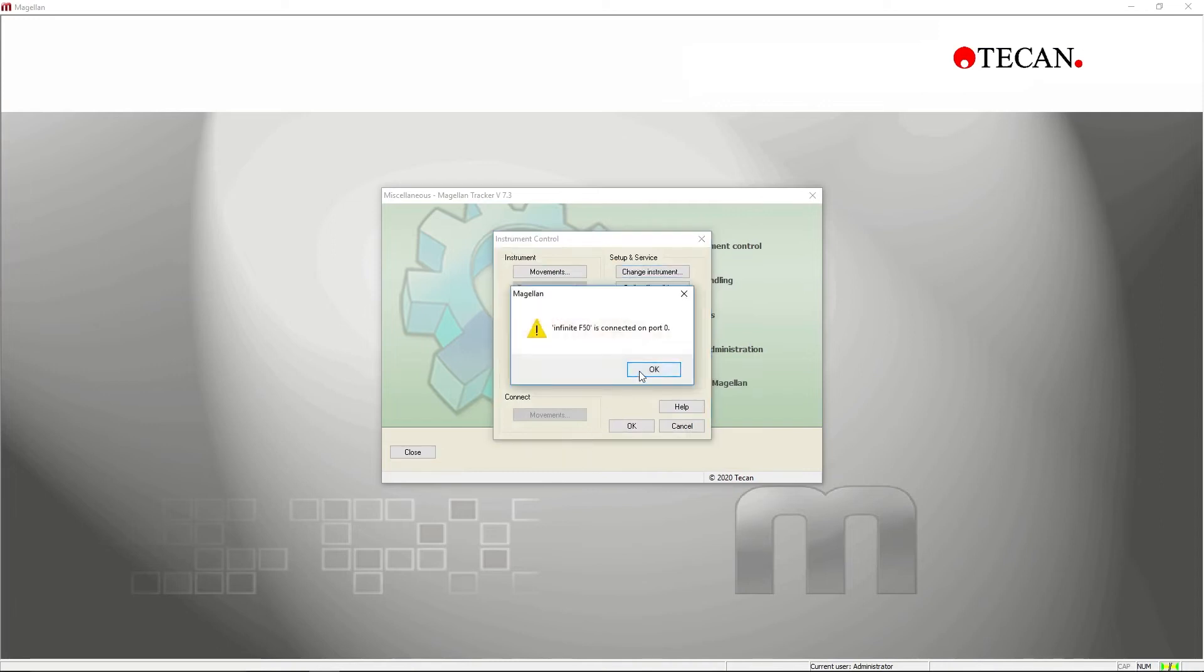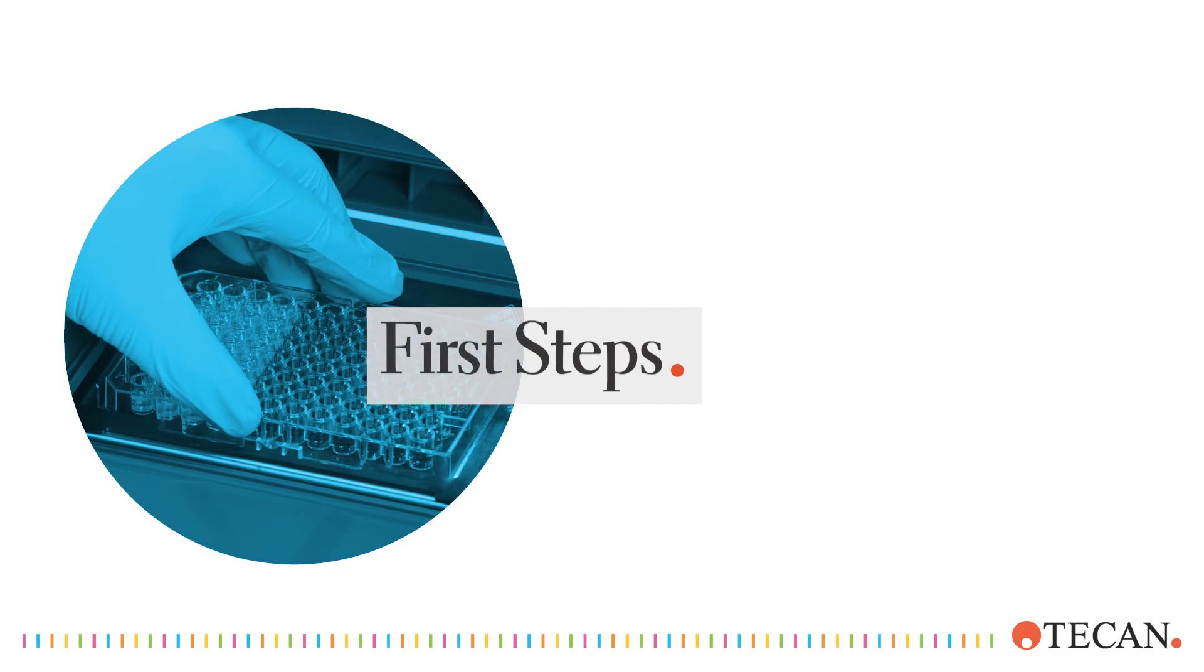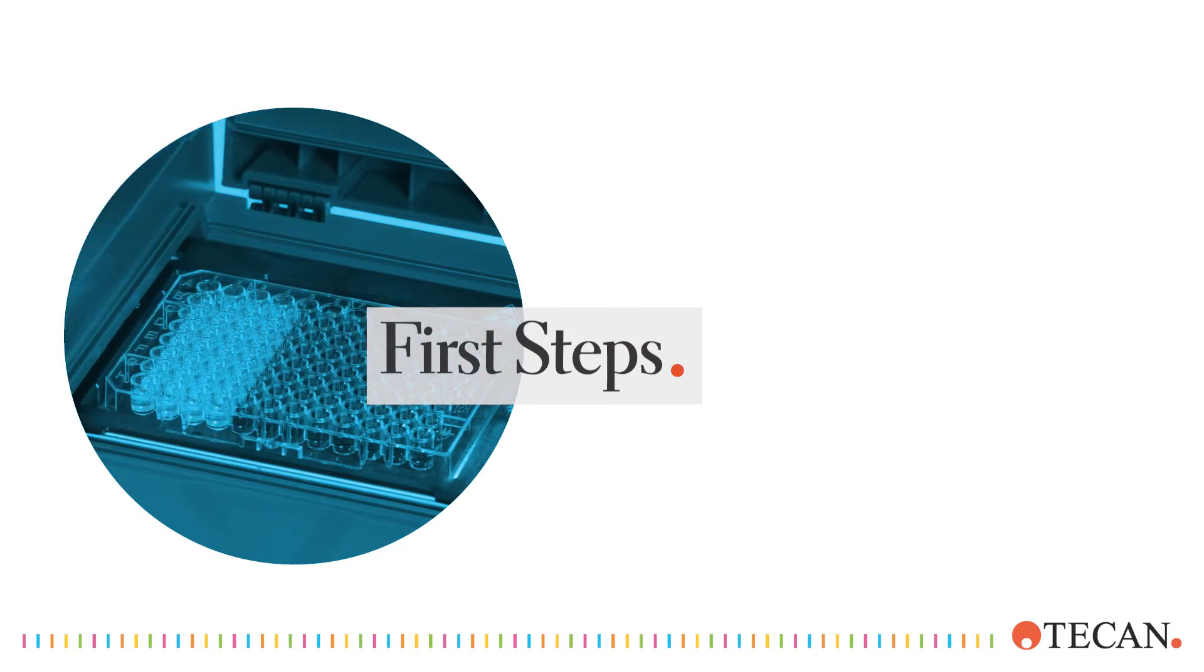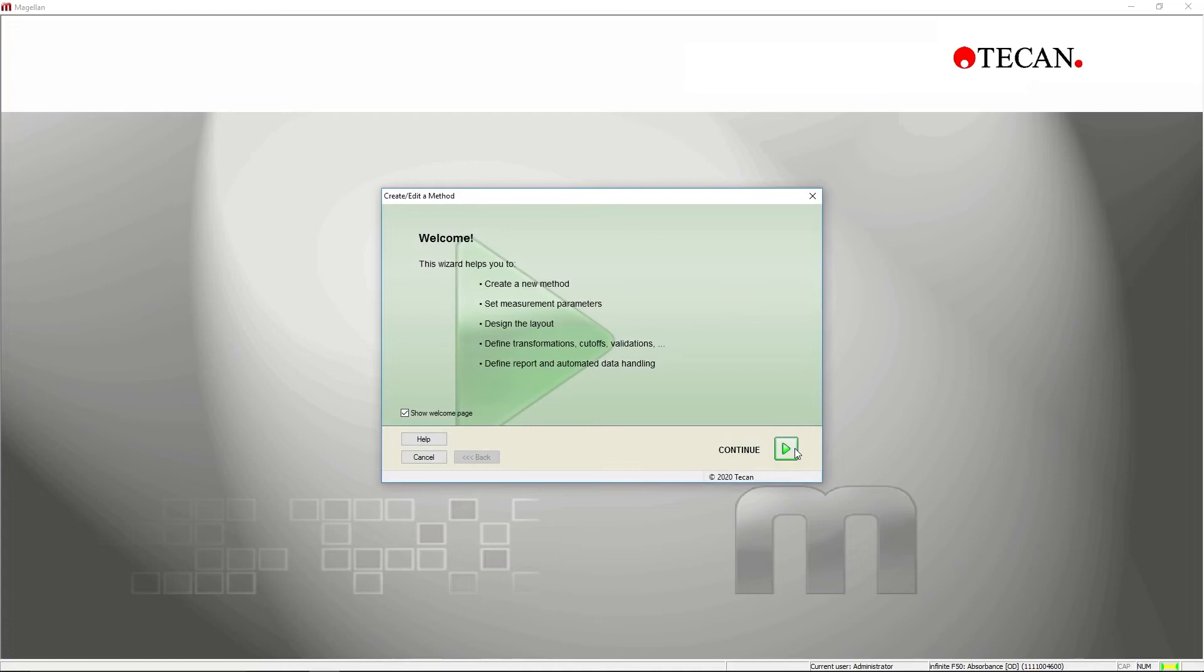Now that you're fully set up, let's get started with your new Infinity F50 and Magellan software. To perform a read, you can either start the measurement directly or create a new method that can be saved and used for future measurements.